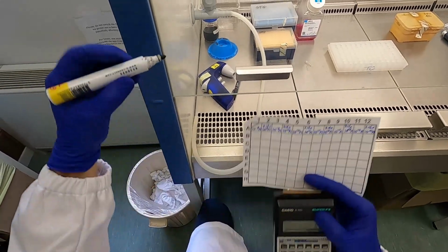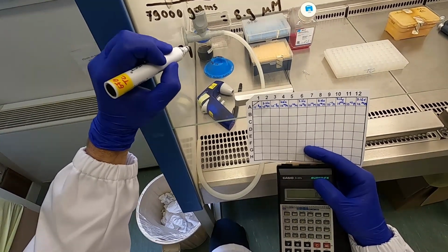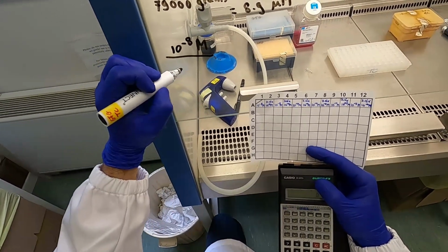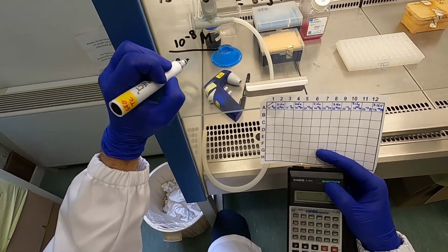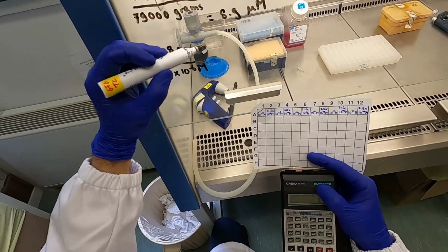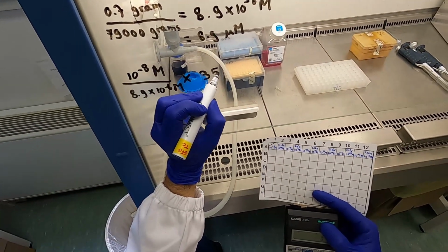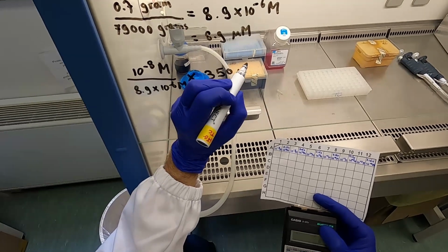So let's see how we're going to dilute. Again, this is repeating what we already discussed with the slides. We have 10 to the minus 8 molar, what we need. And so we divide by the current concentration, which is 8.9 times 10 to the minus 6, which is actually a much higher concentration.